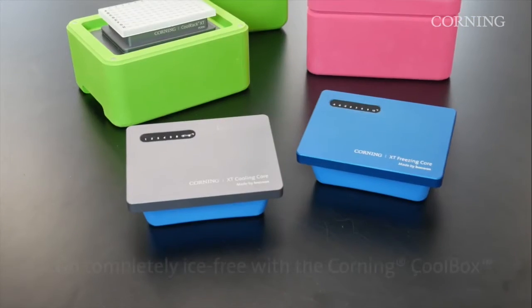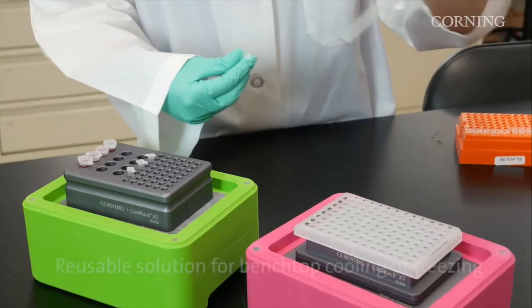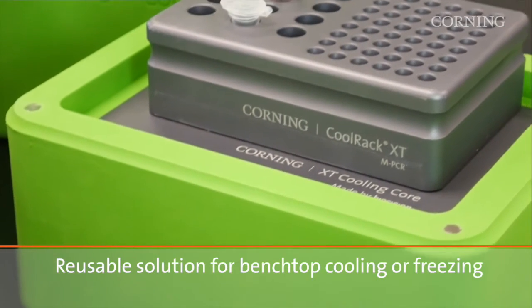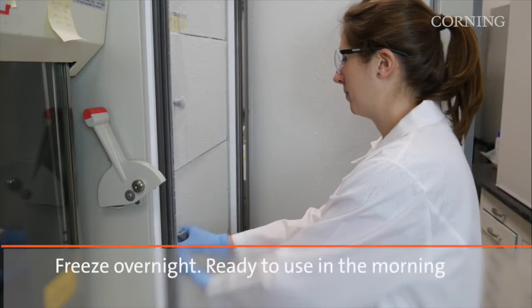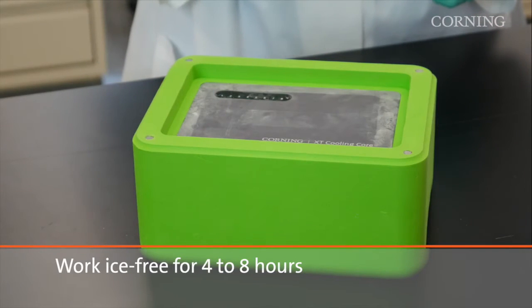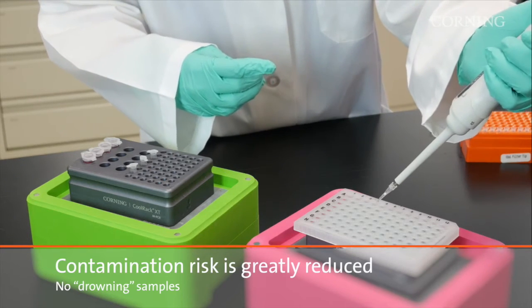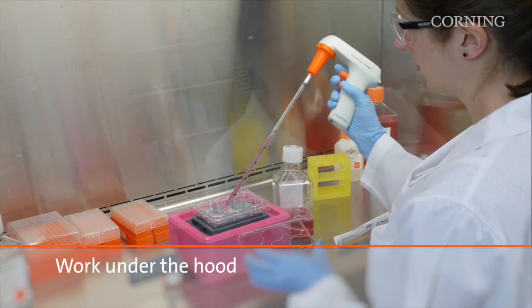To get the best solution, you can go completely ice-free with the Corning CoolBox. Corning CoolBox is a totally ice-free solution that uses a reusable cooling core or freezing core for benchtop cooling or freezing. Simply freeze the core in a -20 degree C freezer overnight. When you are ready to work, place the frozen core into one of the Corning CoolBox bases, where it will last from four to eight hours based on the system that is used. This best solution greatly reduces contamination risk and your samples drowning, and you can even take your cold or frozen samples under the hood to work.